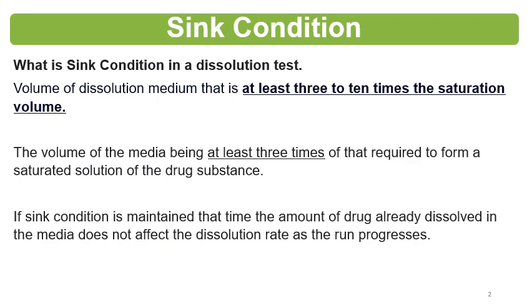of the drug substance. See, sink condition is generally met with the formulations and with the APIs which have high solubility, and sink condition is somewhat difficult to meet with poorly soluble molecules. And for poorly soluble molecules, generally salts are used in the dissolution medium, like sodium lauryl sulfate, and Tweens like polysorbate 20, polysorbate 80. Mainly these are known as surfactants.